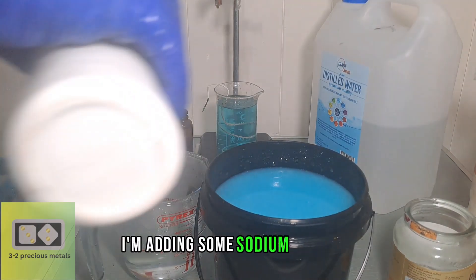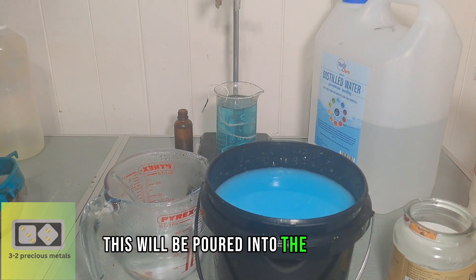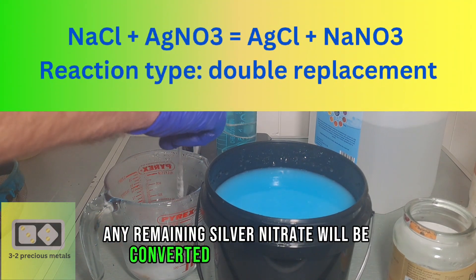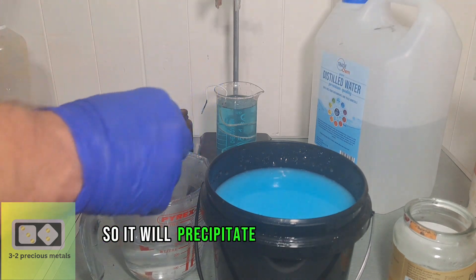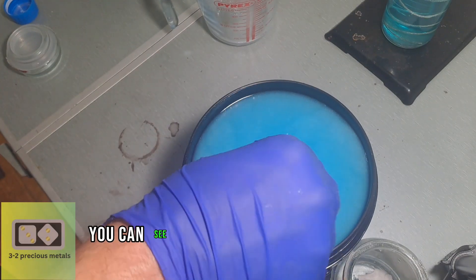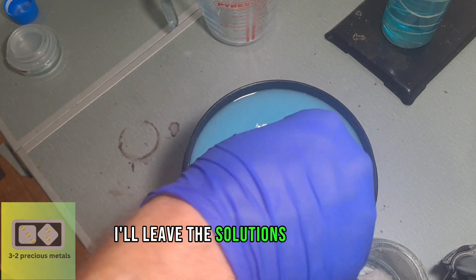I'm adding some sodium chloride, also known as table salt, to some water. This will be poured into the solution. Any remaining silver nitrate will be converted to silver chloride. Silver chloride is not soluble in water, so it will precipitate as a fine white powder. You can see the silver chloride floating around as I stir the liquid. I'll leave the solutions to settle overnight.